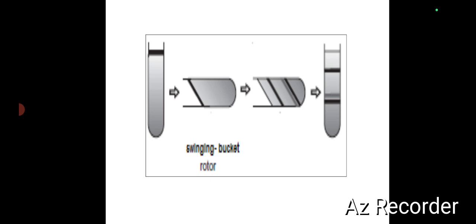This picture shows, in the first tube, the sample kept in during acceleration. In the second and third tubes, the sample is separated as the particles move on like that. Finally, after the centrifugation has stopped, in the fourth tube we can see the separated sample.